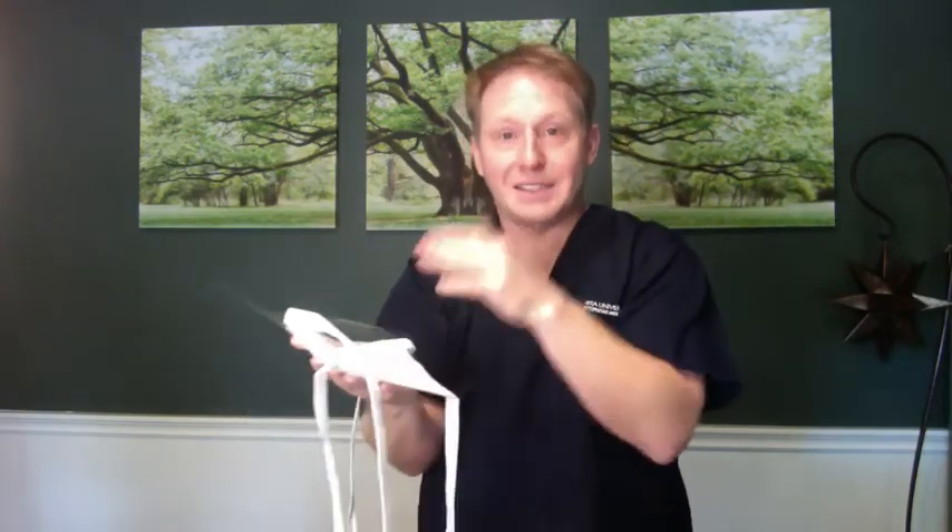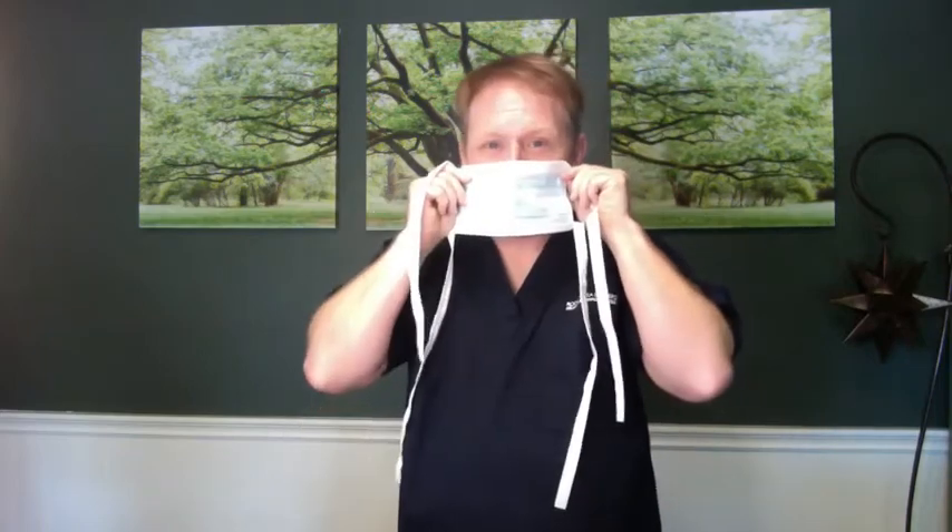Surgical masks also come with face shields. The face shield is on the outside; the lighter side is the inside near your face. You can tie it tight. This is a good option if you wear contacts and need eye protection — it's an alternative to separate goggles.